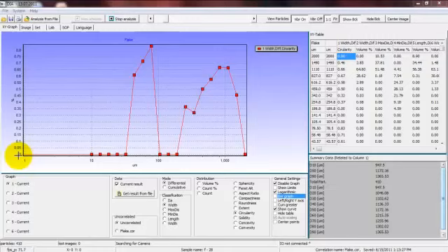For circularity, 1 would be a perfect circle. On the x-axis, we're plotting the size of the width parameter in microns. So we see two modes of high circularities at widths from about 20 to 100 microns and between 200 and 2,000 microns.